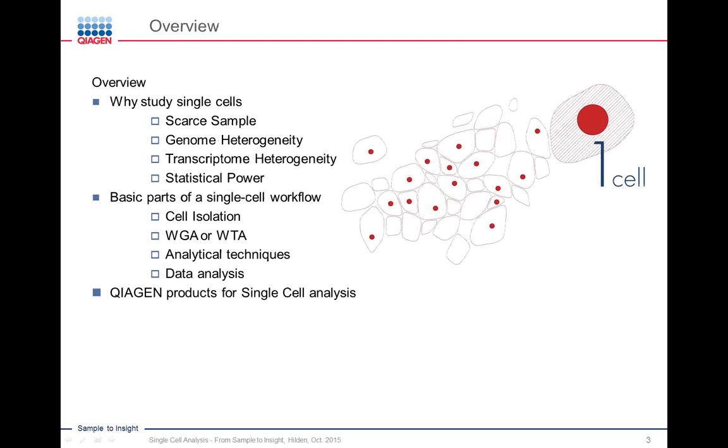I'm going to start with going over, on a very introductory level, why we should care about studying single cells. There are a few things I want to touch on. Some are very pragmatic, some have more to do with analyzing biological samples. And then I'll go into the basic parts of a single cell workflow.